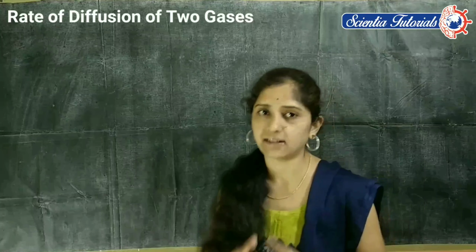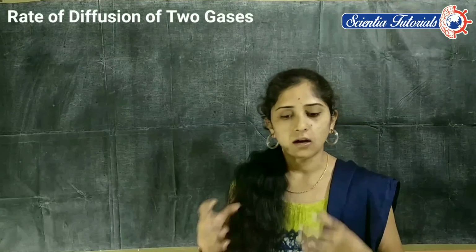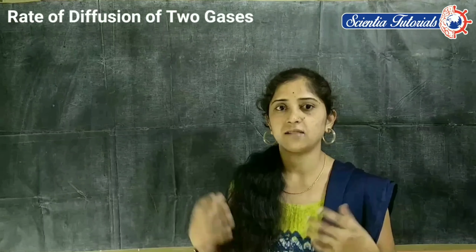And what is the material required? We need some materials to complete this activity and follow the procedure.